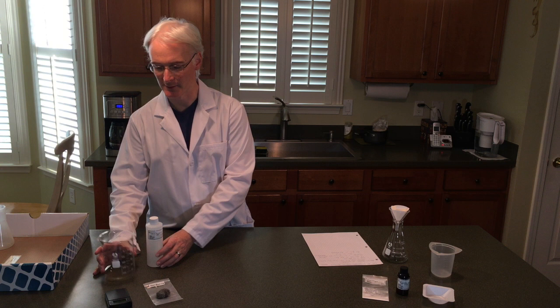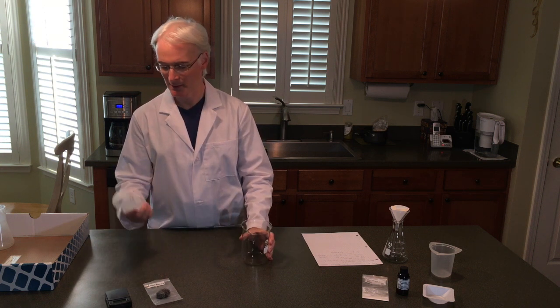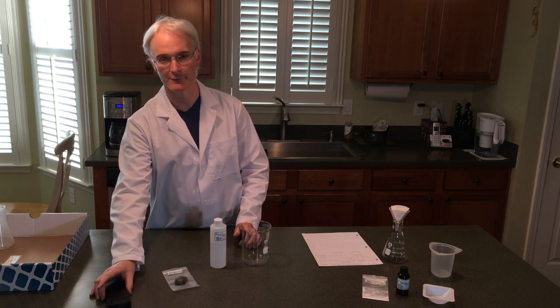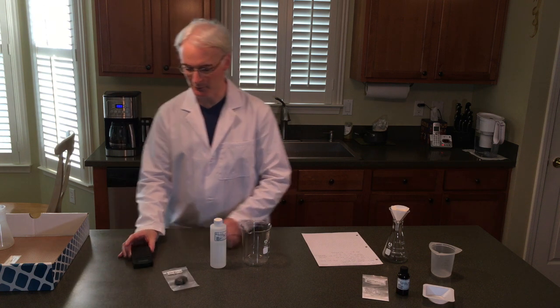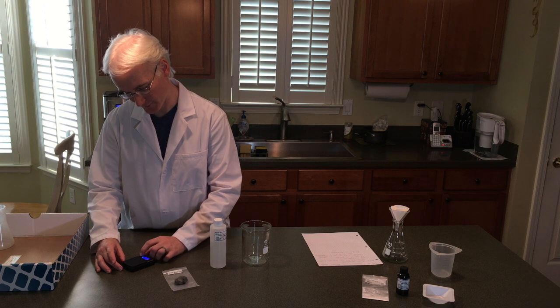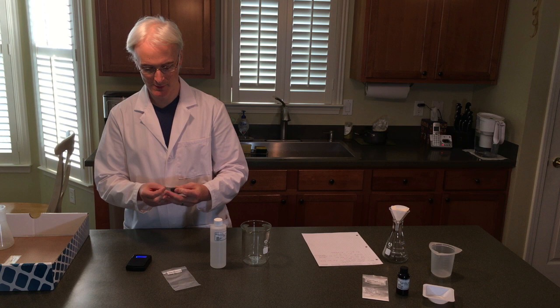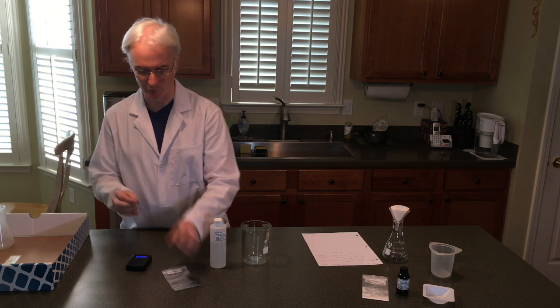Over here we have the large 600 milliliter beaker, we have acetic acid, we have the steel wool, and we have our scale. So what we're going to do first off is turn on the scale, let it zero out, and we'll take 1 gram of steel wool.